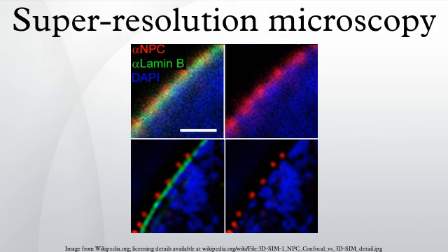To further increase the resolution, one can introduce nonlinearities, which show up as higher-order harmonics in the FT. In reference, Gustafsson uses saturation of the fluorescent sample as the nonlinear effect. A sinusoidal saturating excitation beam produces the distorted fluorescence intensity pattern in the emission. This non-polynomial nonlinearity yields a series of higher-order harmonics in the FT. Each higher-order harmonic in the FT allows another set of images that can be used to reconstruct a larger area in reciprocal space, and thus a higher resolution.